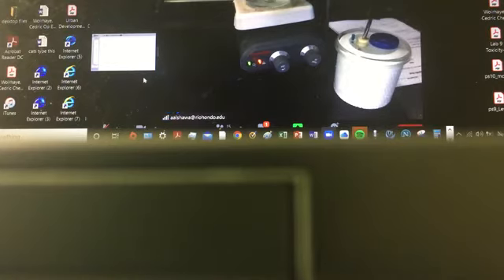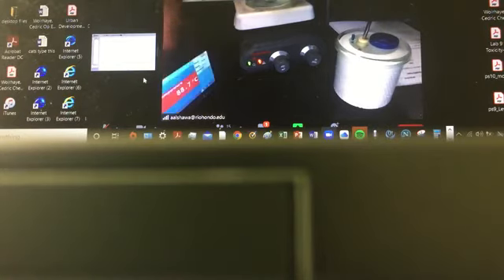All right, so far so good. So the temperature so far is almost 89. Let's give it a chance until I see a number that does not change within a minute, then I'll accept it.